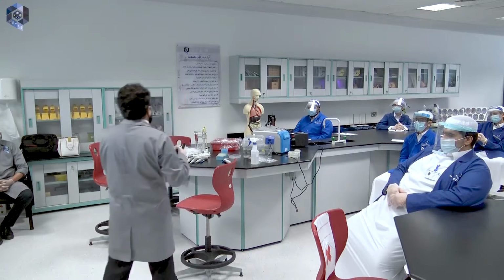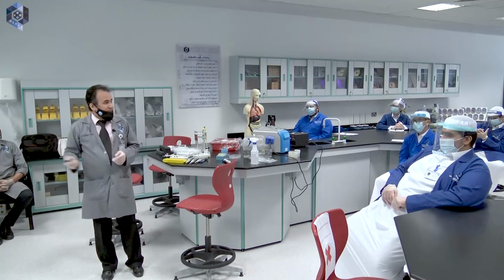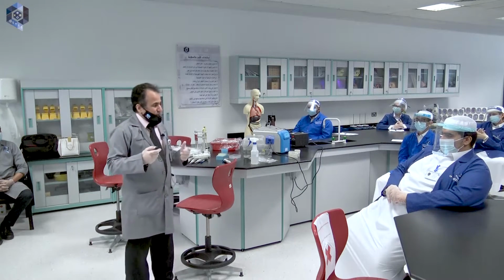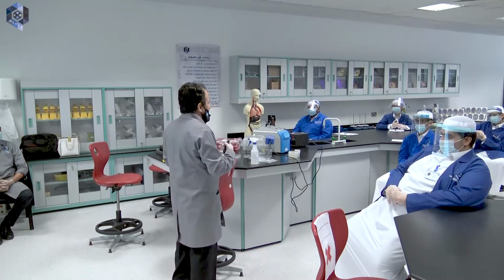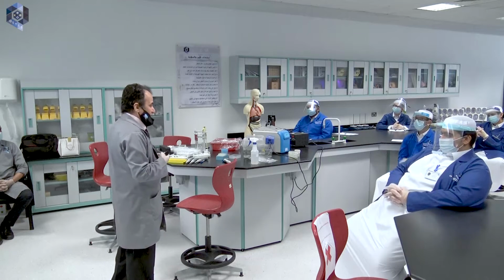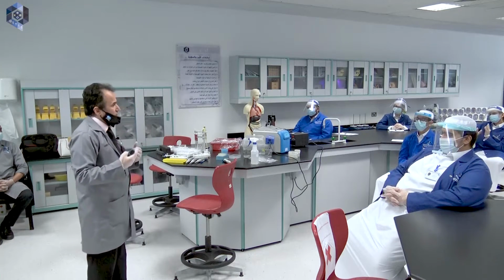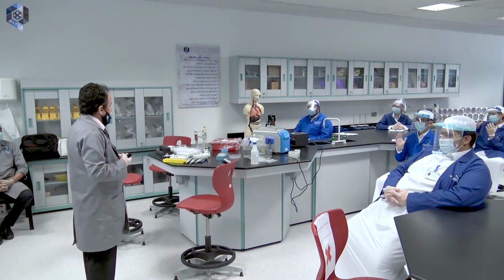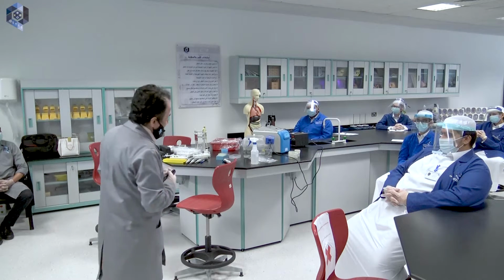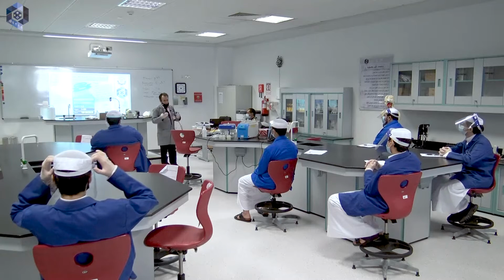We linked them together. How did we link them together? Using what? Yes, Nasser, Shahabik. What did we use to link them? The ligase enzyme. Ligase enzymes join or make bonds between the separated pieces or fragments of DNA. They join them together. Then, how can we know if the recombination was successful or not? Gel electrophoresis. Did we do gel electrophoresis, Tariq? Nassar? Yes, we did. Now, I will show you the results of the electrophoresis. Then we will discuss it together.